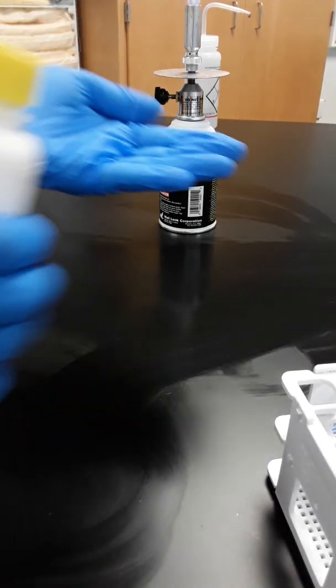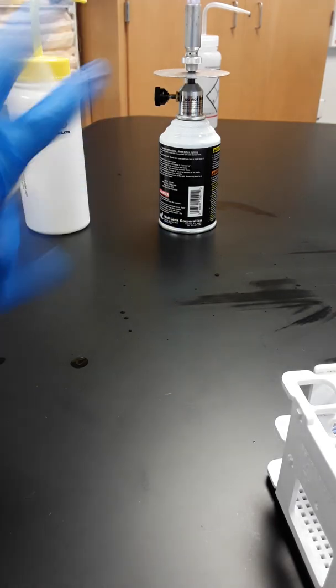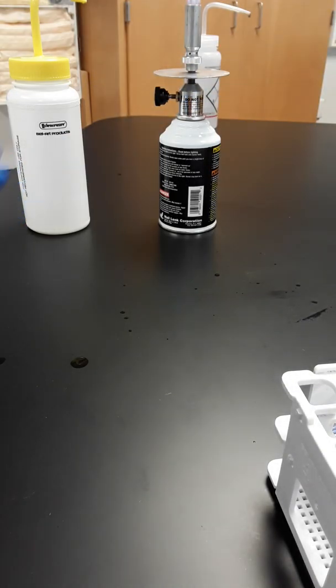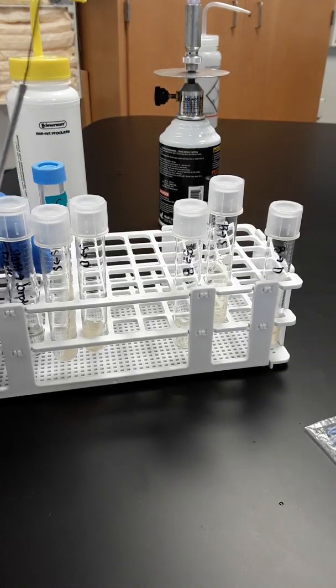And then also for good luck, I always scrub off my gloves. This does not make your gloves sterile. This actually doesn't even make your gloves clean. But I like being OCD. Micro is my chance to be as OCD as I want to be. Okay, so now the whole thing is sterile. And I'm just going to show you with one.